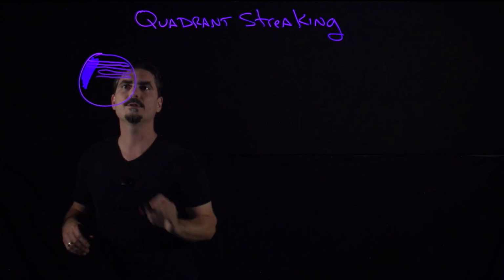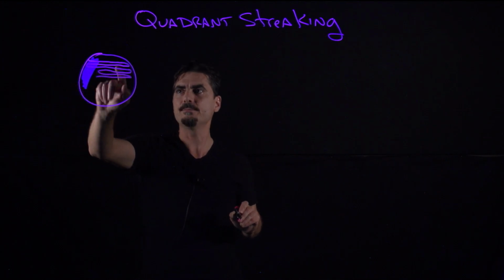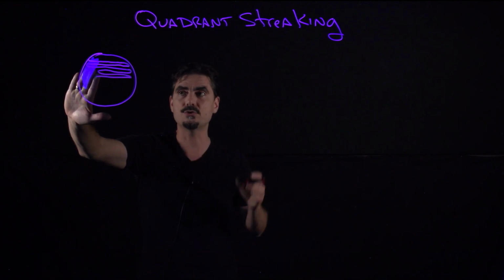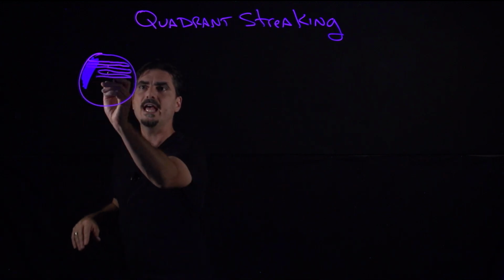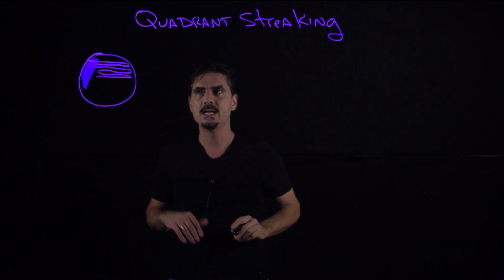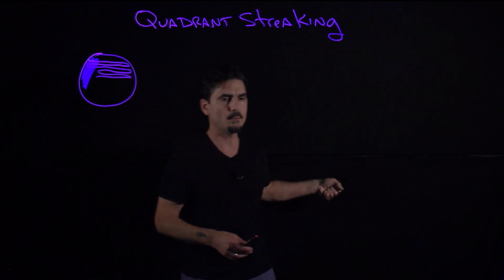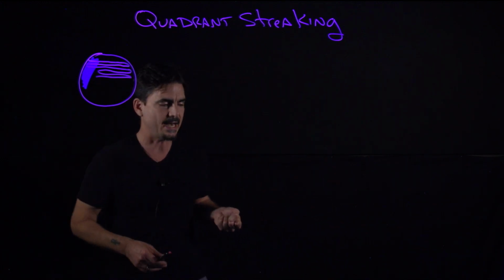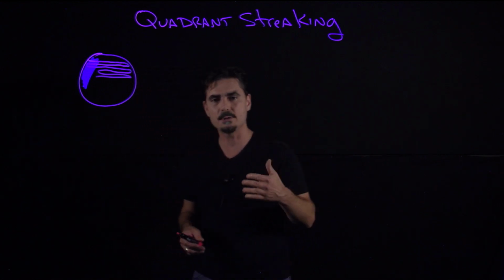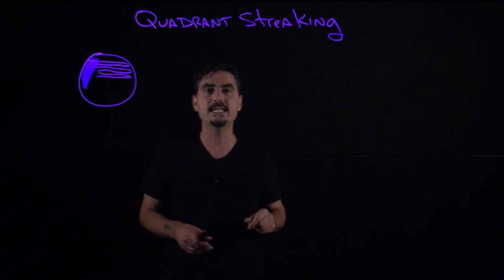And then after that, I don't go back in quadrant 1. I just try to go back and forth, because the first inoculum is going to be the most intense amount of bacteria, the highest concentration. Ideally, I brought enough out, and as we go along, every time I move, there's less and less bacteria, right? I like to use the example of if I had a paintbrush and I were to load it up and start walking around a huge building on the outside, there'd be a lot of paint to begin with. I'd walk around, and over time, there'd be less and less paint being put on the wall because we're running out. It's the same idea as this.